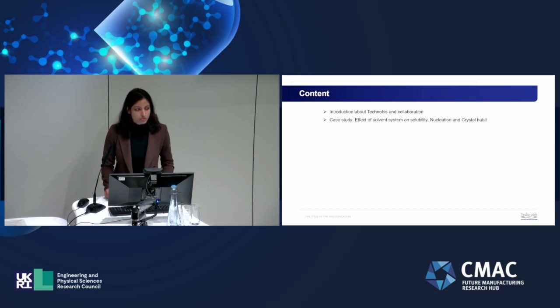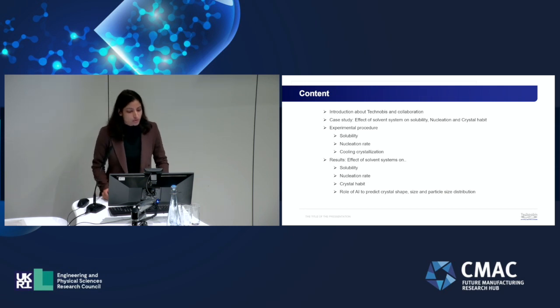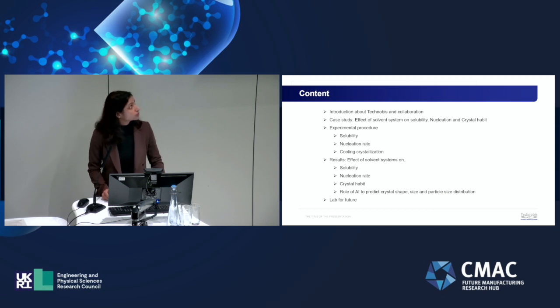Then I will share a case study to see the effect of solvent and solvent system on solubility, nucleation rate, and crystal habit, in which I will first share the experimental procedure or methodology followed to determine the solubility, nucleation rate, and cooling crystallization experiments using Technobis instruments. Then I will share the results to see the effect of solvent system on solubility, nucleation rate, and crystal habit. From crystal habit, we will see the role of AI to predict crystal shape, size, and particle size distribution. And in the end, we will look into the future collaboration with CMAC, that is lab automation.